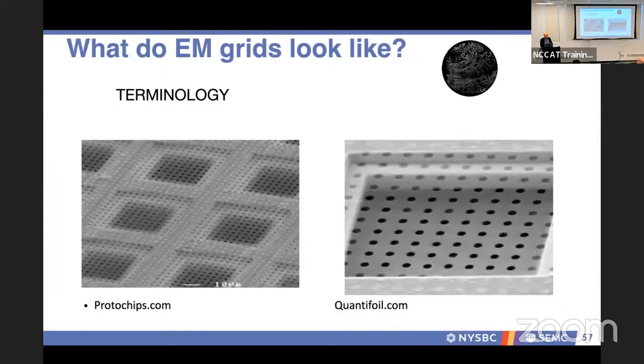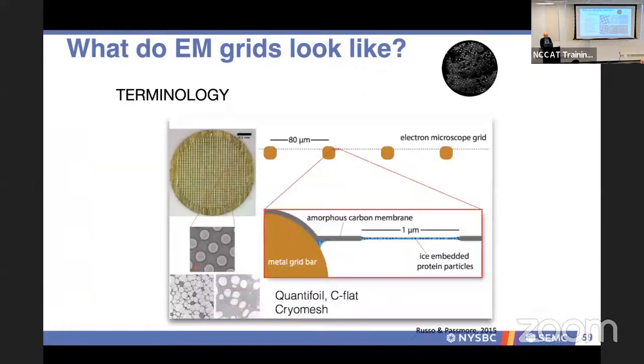And why that is very important is that your foil and your grid, since they could be the same material or differing materials, will have different thermal contraction rates. Molybdenum and carbon have very similar thermal contraction. Copper and carbon do not. And so that's where you can get beam-induced motion, because what could happen is that your foil is under strain versus the grid. And when you put energy in the system, then that is released. Typically, you'll see that it's doming into the beam.